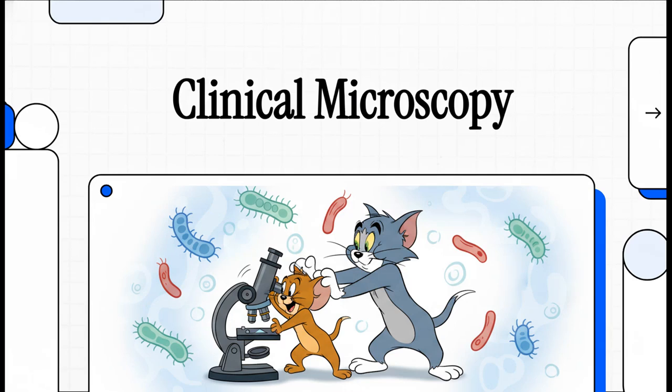Welcome to The Explainer. Today, we're diving into what is arguably the single most important tool in any clinical microbiology lab, the microscope. It's our window into the invisible world of pathogens, and truly mastering it is the absolute key to getting an accurate diagnosis.